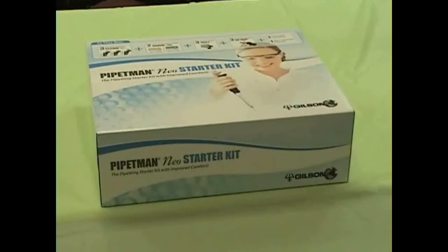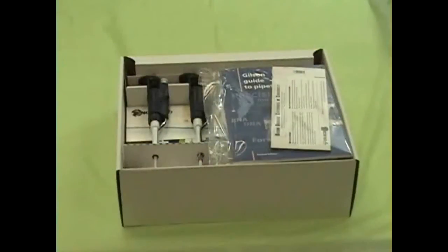Save your lab money with the Pipetman Neo Starter Kit. These kits are priced for less than what the pipettes alone cost, and you get lots of fun extras.